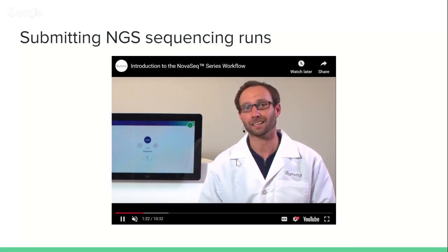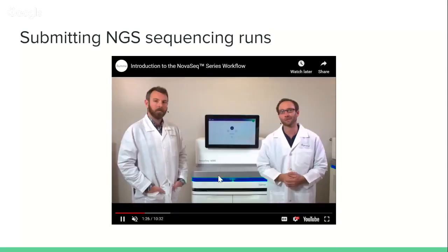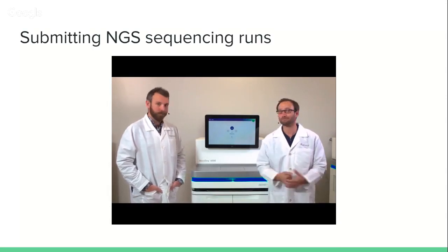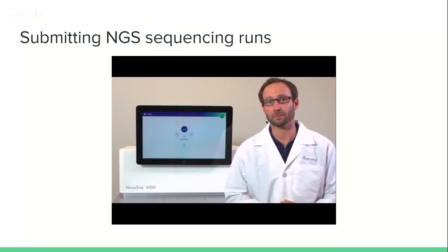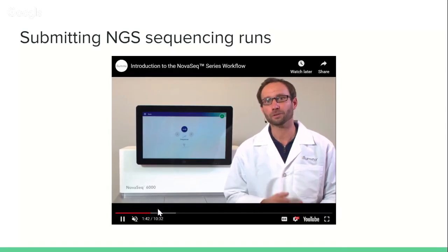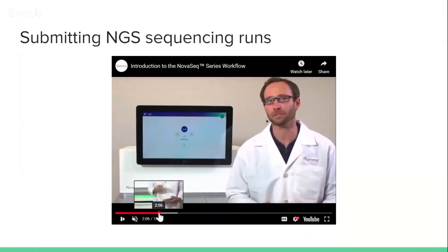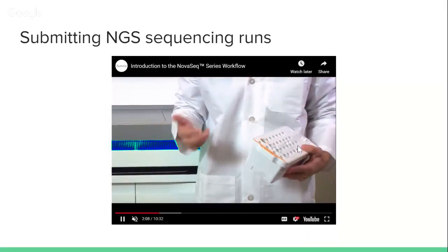But for Illumina NovaSeq, then you'll have a method that is relatively simple nowadays compared to what it was 5-10 years ago, of taking the pool of samples that you had from the library NGS preparation, feeding the machine with all the cartridges needed, and starting the sequencing run. Importantly, you will also connect it to your BaseSpace account in the cloud.